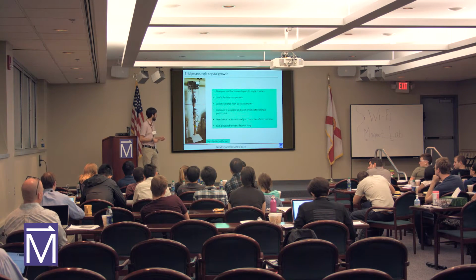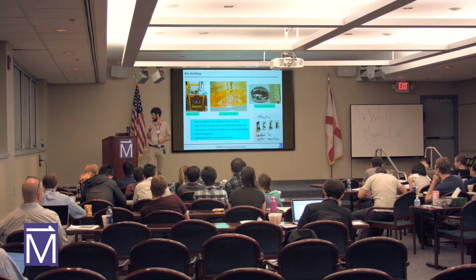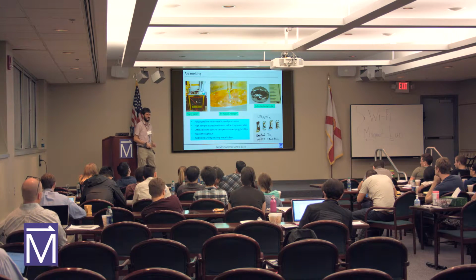When you do the arc melting process, it's rapidly cooling at the same time. So when I try to grow or melt at really high vapor pressure, that really messes it up. It's really hard. So I should have said that: arc melting is not well suited to high vapor pressure materials. So what happens to follow?